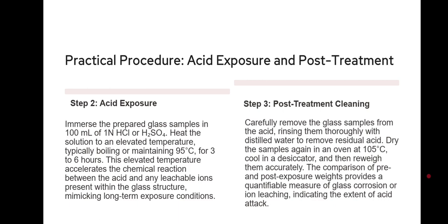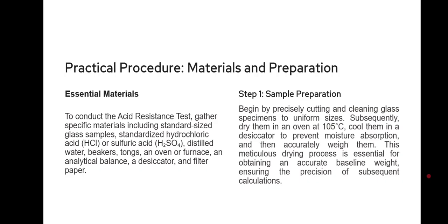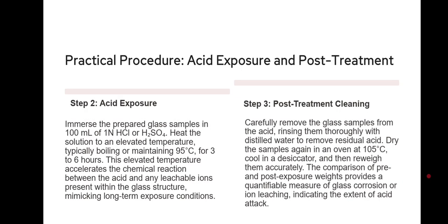Step by step procedure. The first step is sample preparation. Cut the samples to uniform sizes to ensure equal surface area. Wash them to remove dirt or oils.